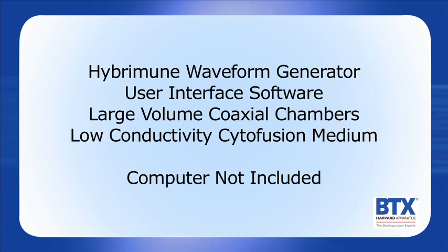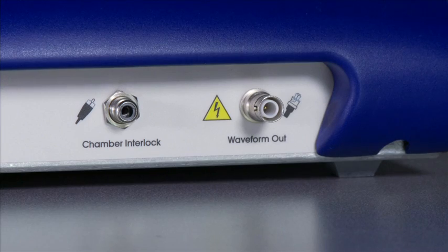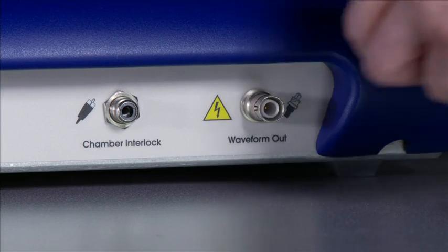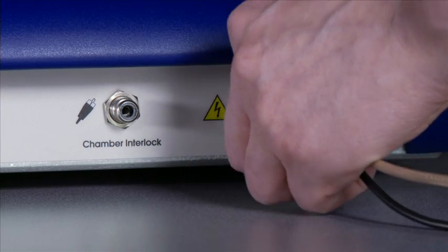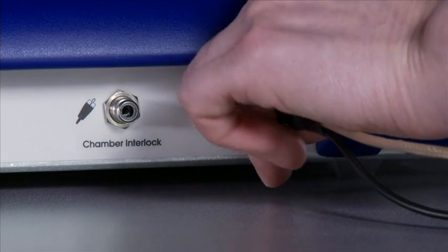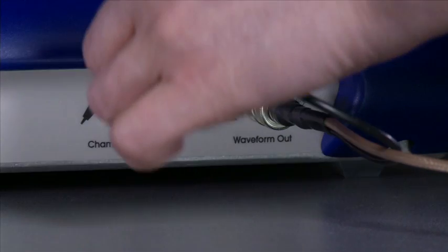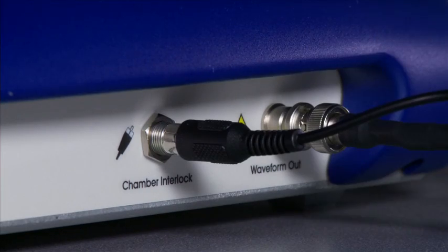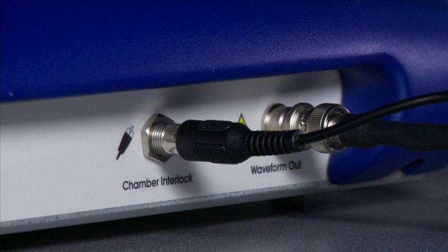A computer is required for the application software but is not included in the system. There are two connections made with this cable assembly. Connect the SHV-type coaxial plug to the jack labeled waveform out, then connect the RCA-type phonoplug to the jack labeled chamber interlock. Generally, this cable only needs to be connected at the time that a chamber is to be used.